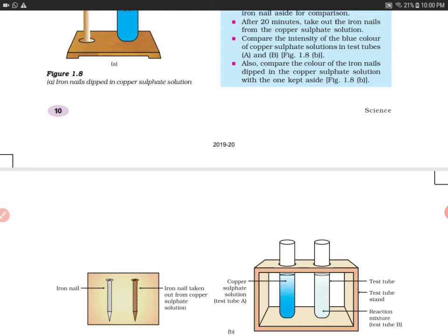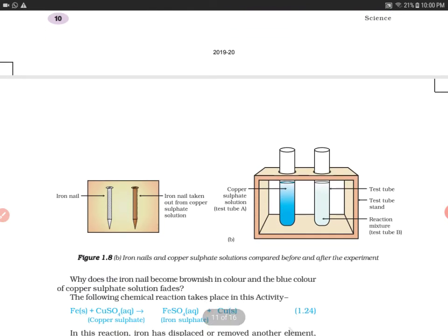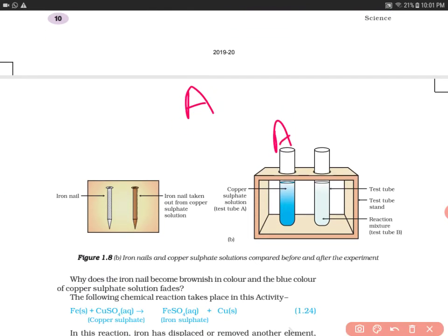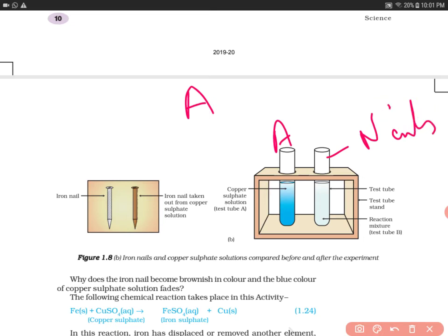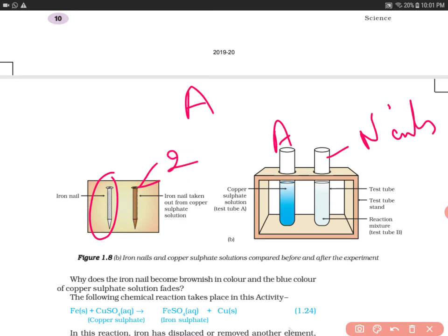Now compare the intensity of the blue color of the copper sulfate solution in test tubes A and B. In test tube A we have not added nails, and in test tube B we have added nails and dipped them in the copper sulfate solution.